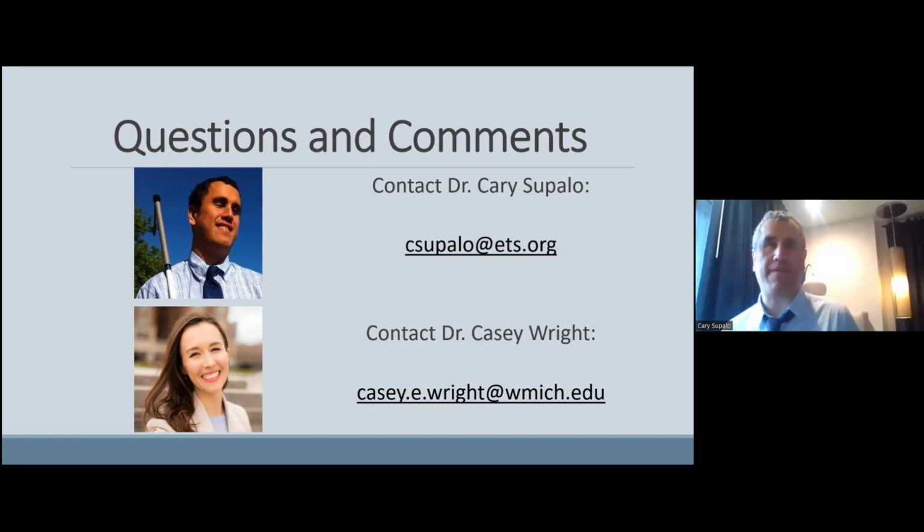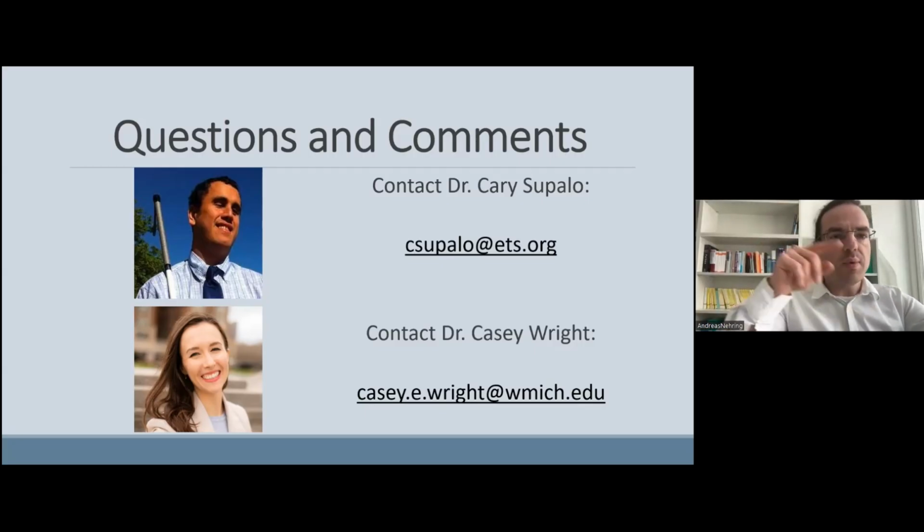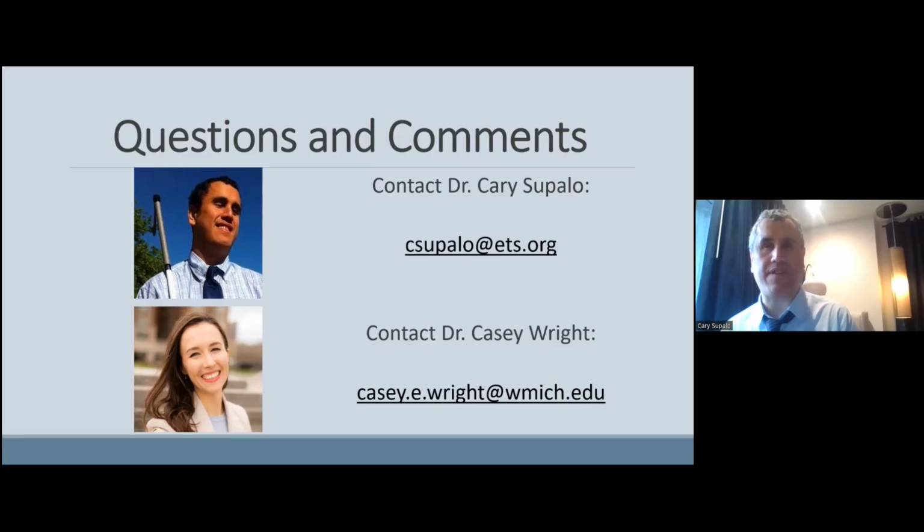You're referring to visual observations? Yes, the visual ones. Briefly, I mentioned the sound sensor that provides access to qualitative representation of visual information, and what Dr. Wright mentioned about the colorblind applications that provide text, spoken or visual text information about color, are great ways to access visual observation information.